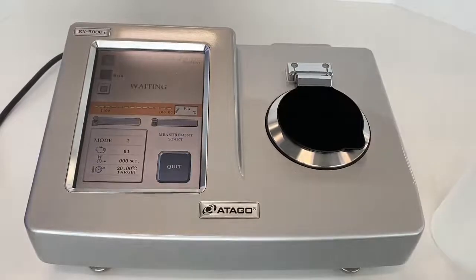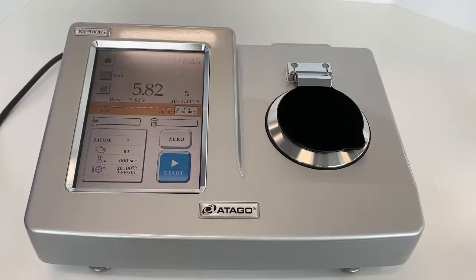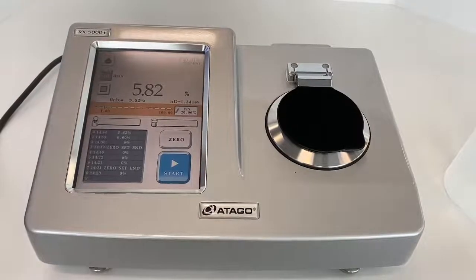We are using the same tomato juice sample for RxI. The reading is 5.82%. Remember the Rxα value was 5.80%, so there is a 0.02% difference between the two instruments. But the accuracy of the Rx 5000 series is ±0.03%, so this difference is within the accuracy range. Also, the sample is tomato juice, which can easily build up on the stage.